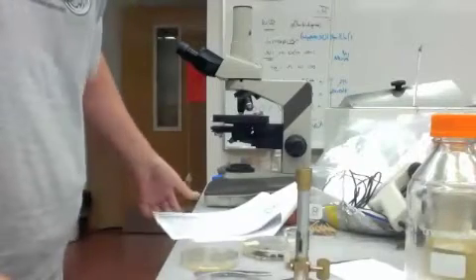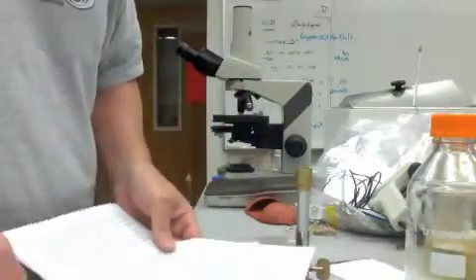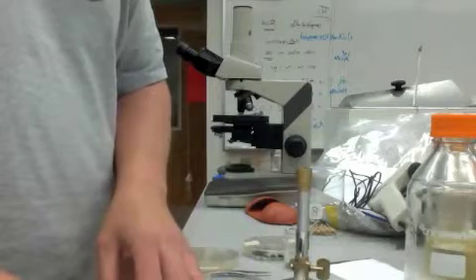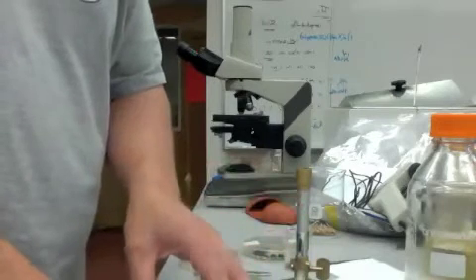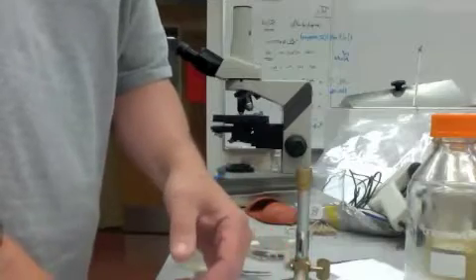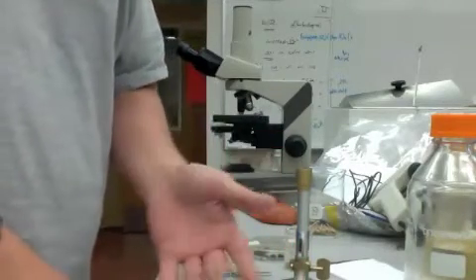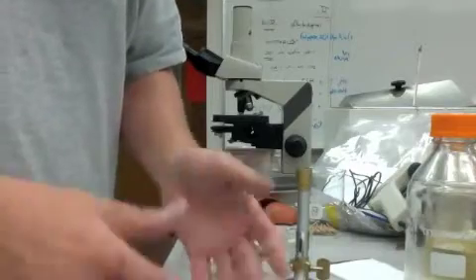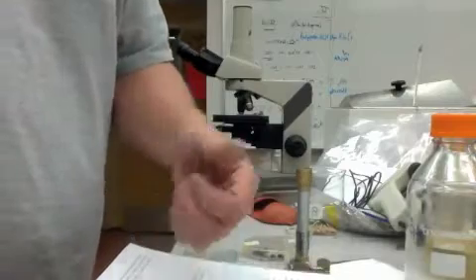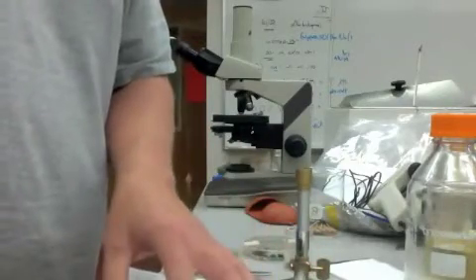So you're also going to be doing enrichment isolations. What I want you to get out of the enrichment isolations really is to understand what each of the media are, why they're enriching for what they are enriching for, what's in them that allows certain things to grow, other things not to grow, how you're incubating them, how you're treating the sample. Basically understand what enrichment is and know the difference between, for instance, a selective medium and a differential medium. That's very important for all of these.